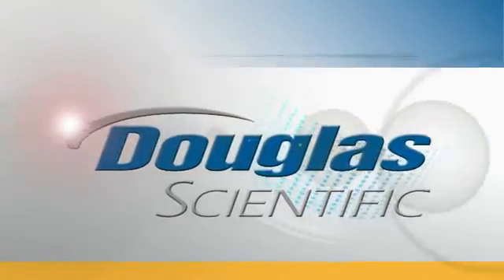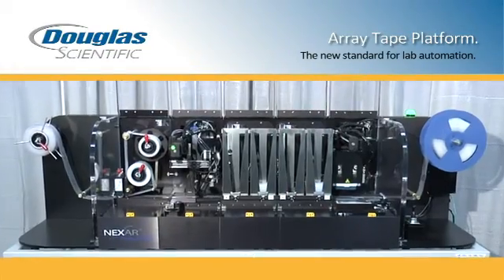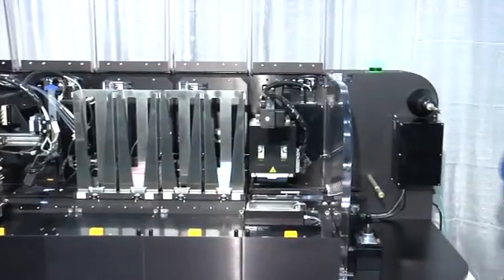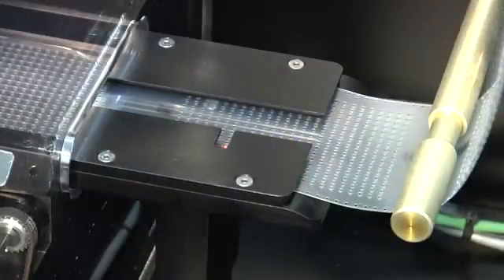The ArrayTape platform is the new standard for high throughput applications. Automated inline modular instrumentation is fully integrated for ArrayTape, a flexible microplate replacement.